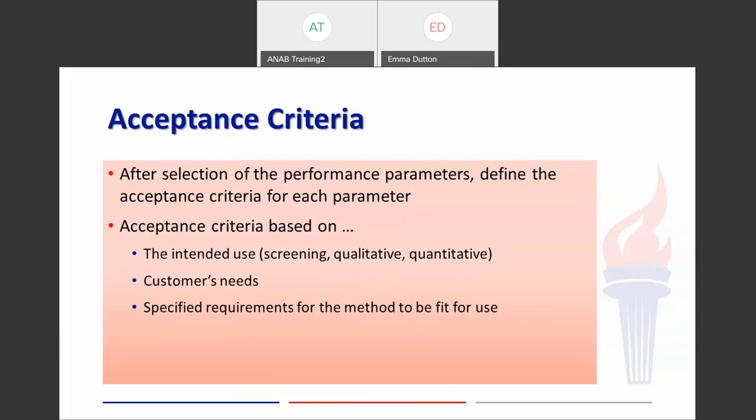I don't think the intent was that when you're sending it out for calibration you need to verify that. But I can tell you from experience, I have had pipettes come back and not meet my specifications after calibration. So it's not a bad thing to do. But you do need to make sure it's meeting your requirements before you return it into service.